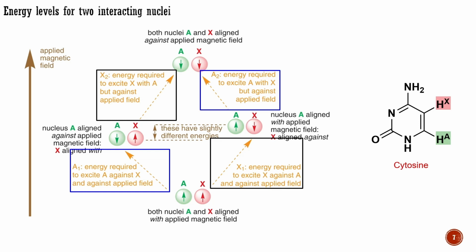Each proton now gives 2 lines, a doublet, in the NMR spectrum, and the splitting of the 2 doublets is exactly the same. We describe this situation as coupling. We say the HA and HX protons are coupled. I will be using this language from now on, and so must you.